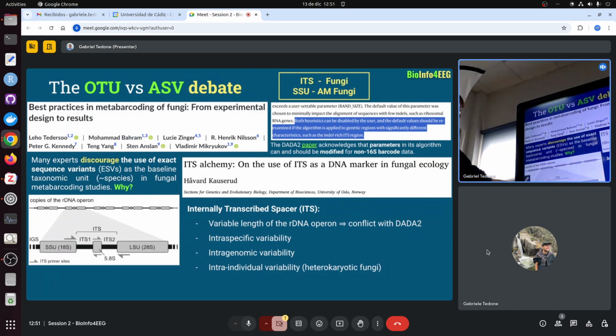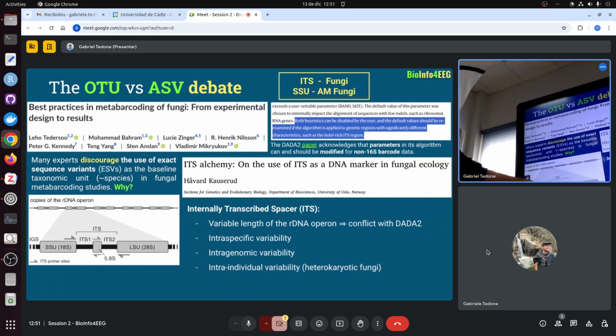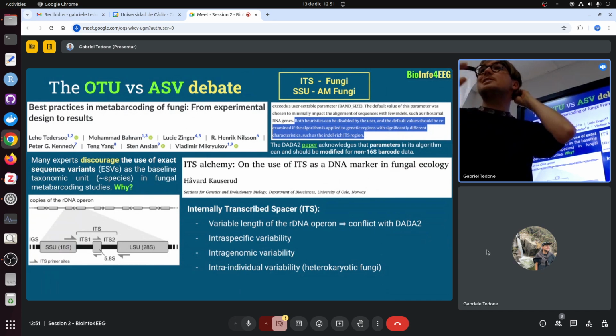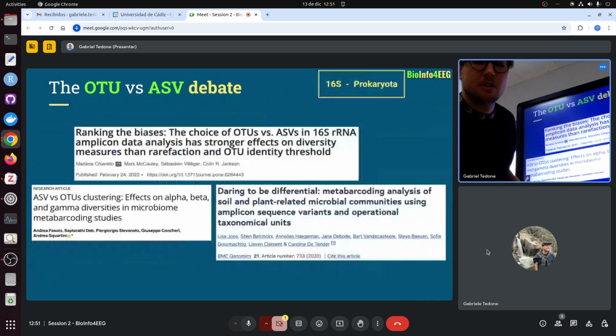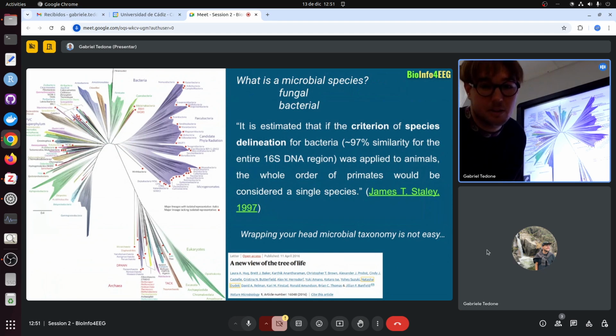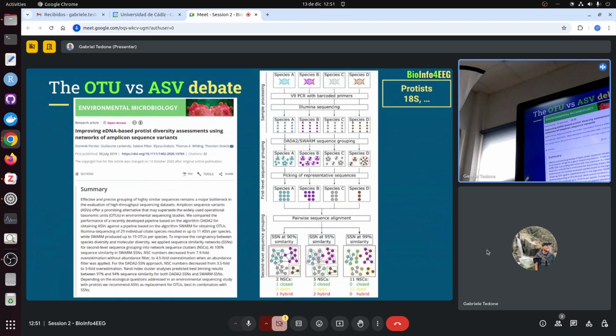Also, besides ITS, some people use the small subunit barcode, for example, for arbuscular mycorrhizal fungi. So there's no perfect barcode. This we saw in the last session. So you're always limited by the barcode you use, and some barcodes will work well for one branch, but will not work well for all the other branches. And even within here, which is where eukaryotic fungi are. For protists, I don't know much about. Hina knows for sure much more. For protists, ITS sucks.